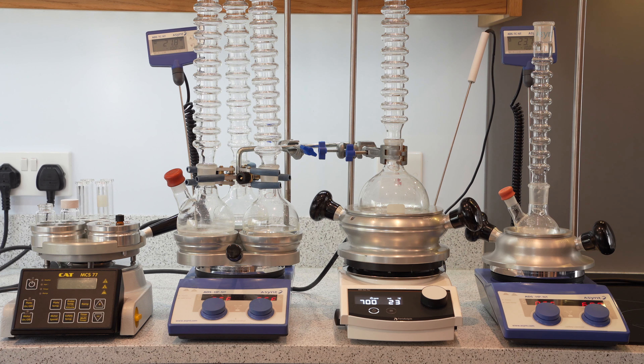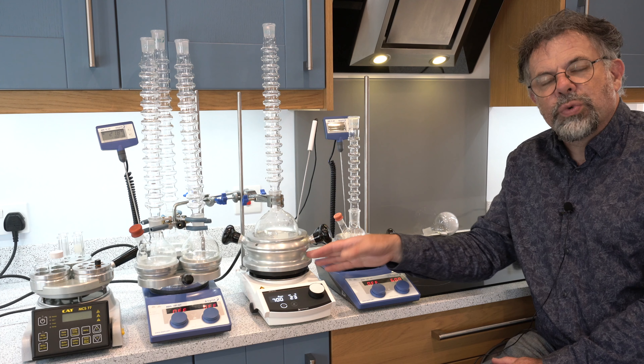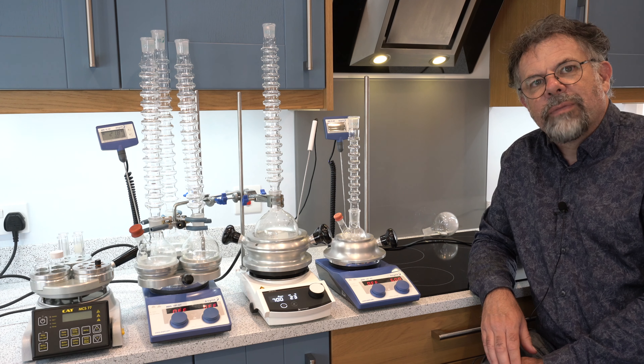Next to it we have our most popular and best-selling product, DrySyn Classic. This allows experiments from 25 millilitres in round bottom flasks up to 1 litre in round bottom flasks.